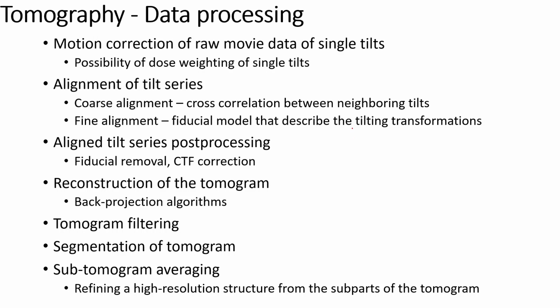Now, tomography data processing. We acquired our tilt series, and now it's time to process it. Some of the steps are the same as for SPA. Some of the steps will differ. At the very beginning, we of course can do some motion correction of the raw movie data frames of single tilts.